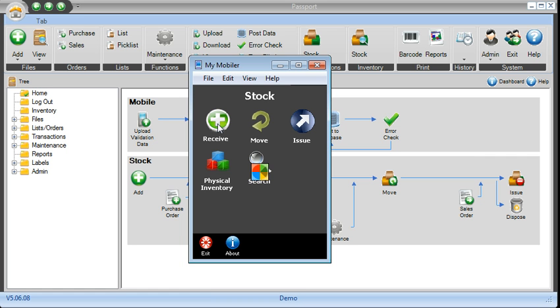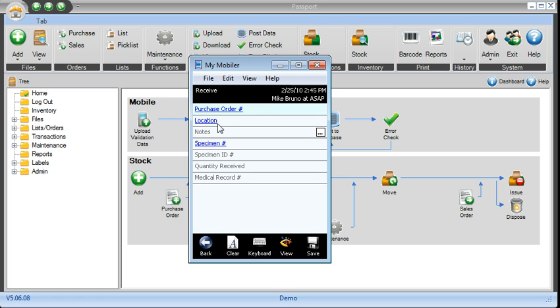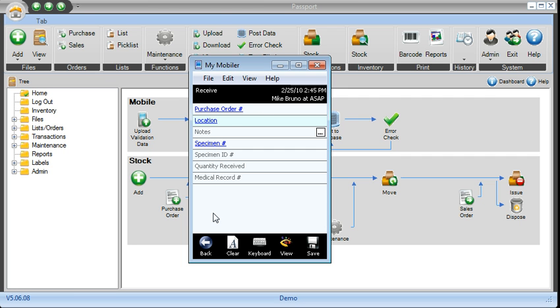And at this point, it's just a matter of scanning your barcode. So you scan the location, you scan your specimen number, ID, quantities, medical record, keeping in mind that these field names you can add to them and you can rename these fields to use terminology specific to your company.